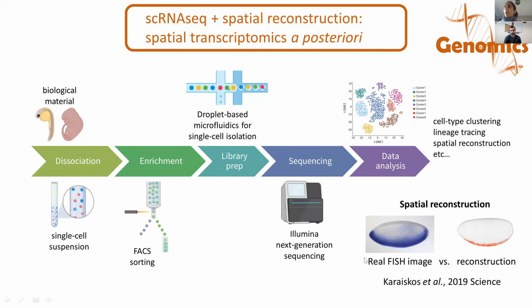And this is an actual example of something that has been done. So this is the real in situ image of the expression of a gene. And this is the reconstruction based on single cell RNA-seq data. And this is a Drosophila embryo.